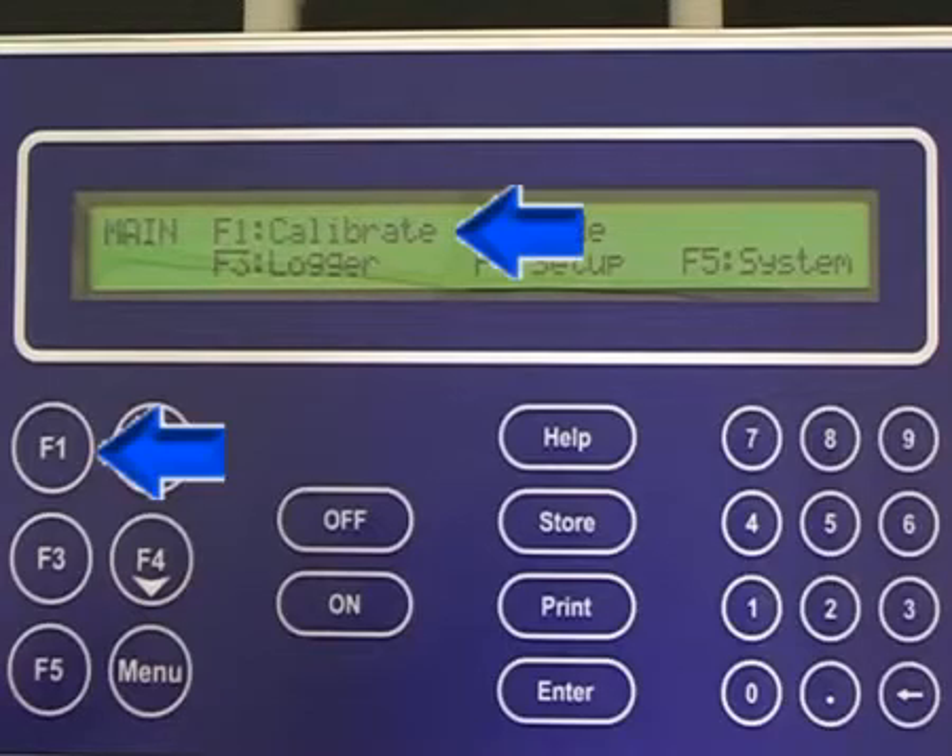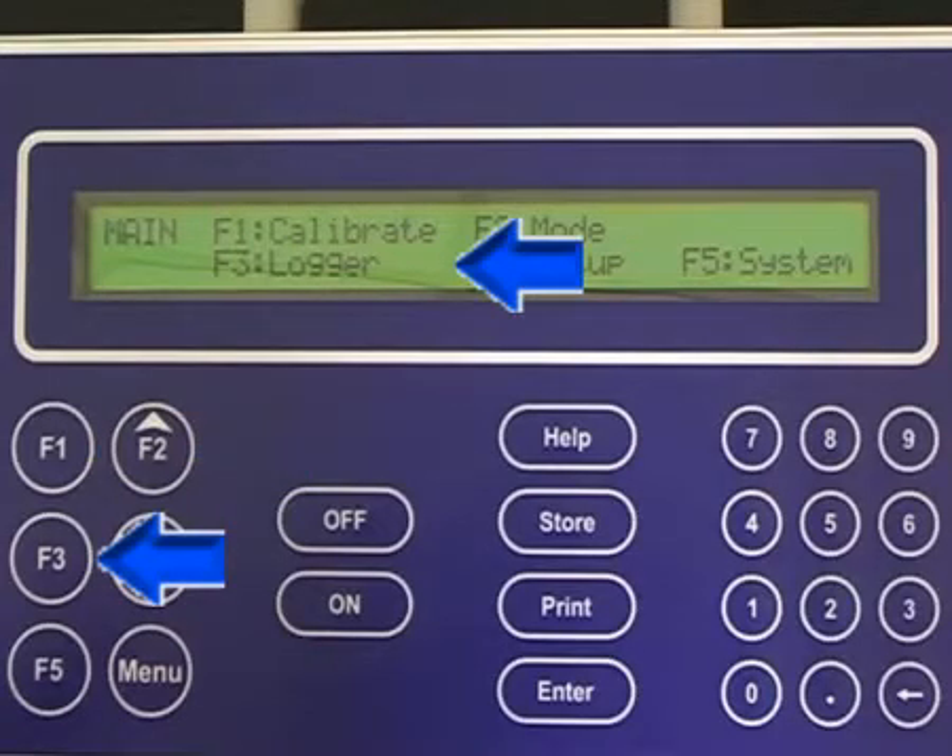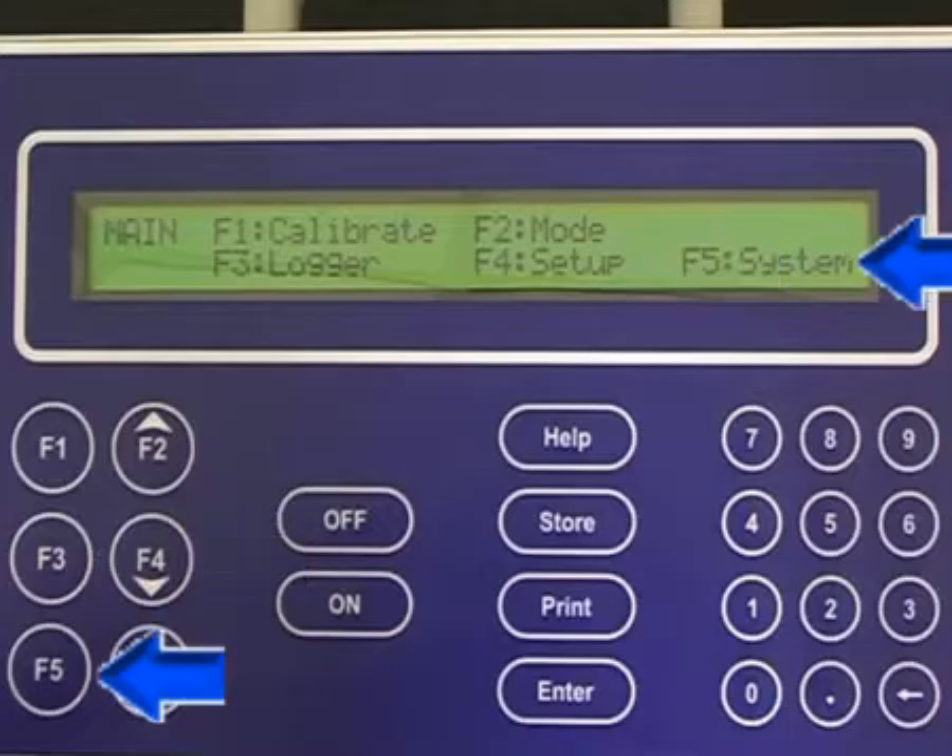F1 is calibrate, F2 is mode, F3 is logger, F4 is setup, and F5 is system.